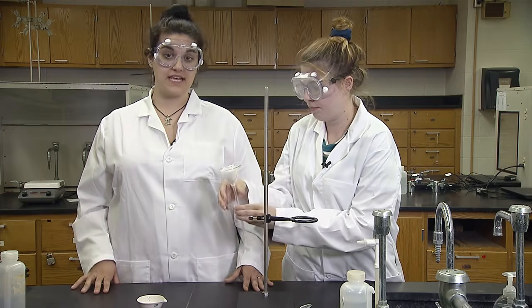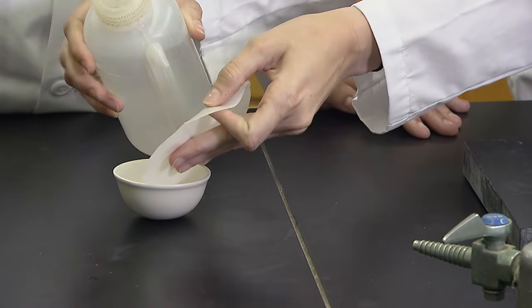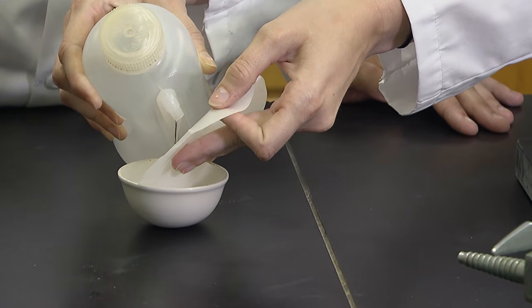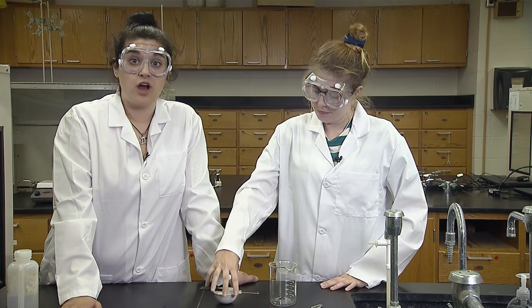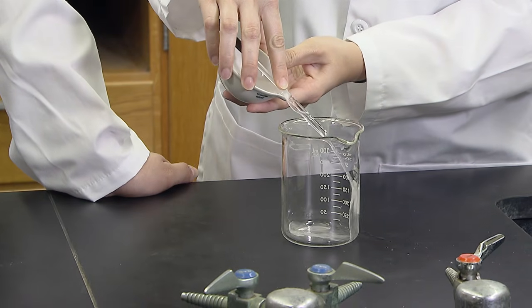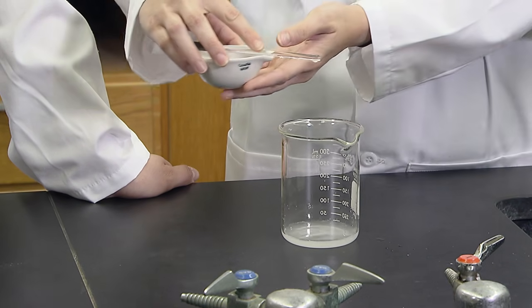Remove the filter paper into the evaporating dish. About 5 milliliters of water is used to wash the solid into the dish. The filter paper can be thrown away when finished. We let the evaporating dish sit so the solid could settle to the bottom. Decant the liquid off the top. See the How to Decant video for more detailed instruction. Nothing is in this liquid, so it is discarded to the waste beaker.